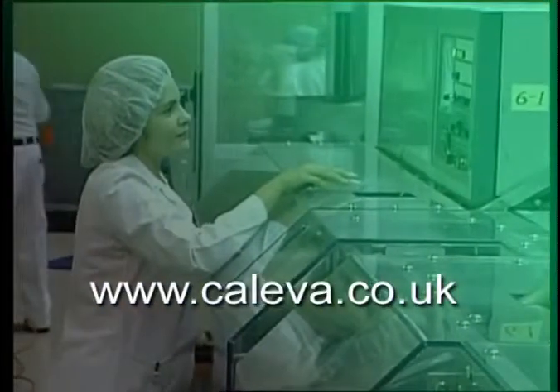This video gives a brief overview of the capabilities and applications of the Mixer Torque Rheometer.